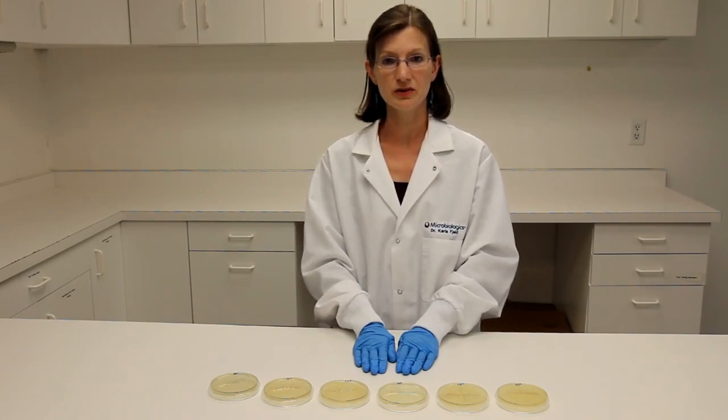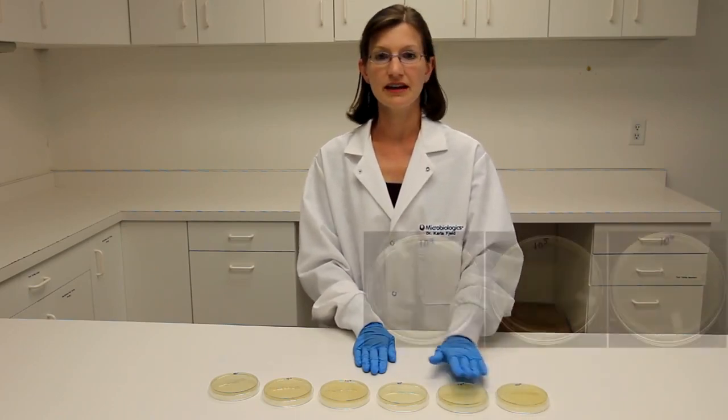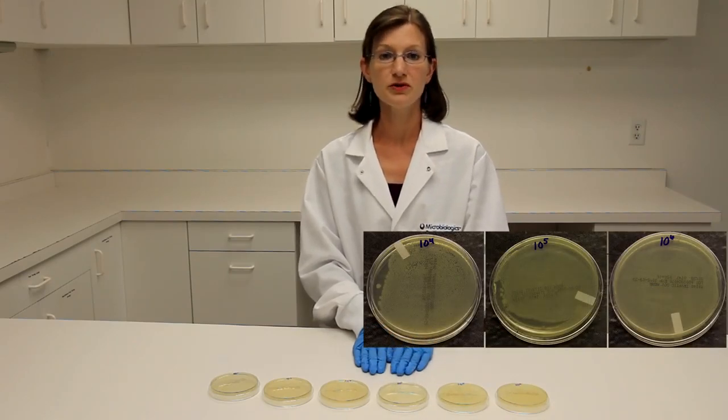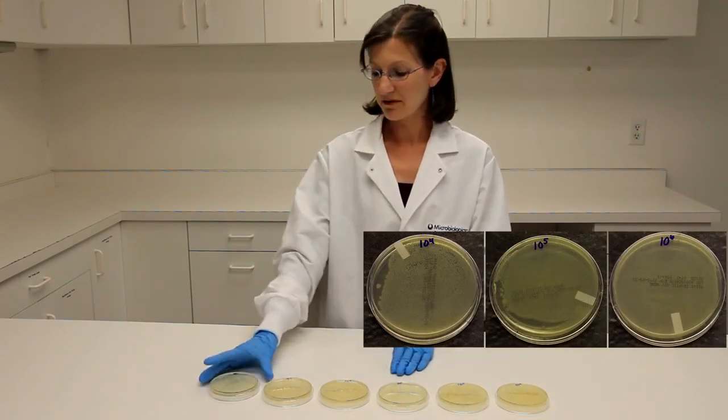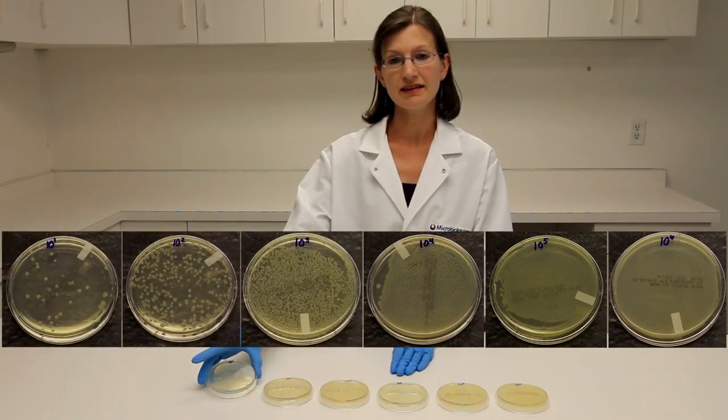Most of these gave us either a full line of bacterial growth or too numerous to count colonies. Our final dilution gave us an easily countable plate.